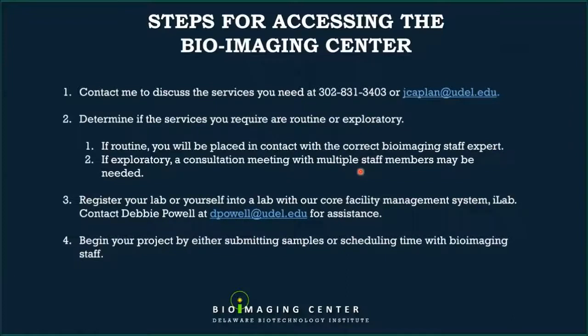So for routine services, I'll probably place you in contact with the correct bioimaging staff expert. For exploratory studies, or if you're not quite sure what you need, often we require a meeting. So it can be a consultation meeting with multiple staff members. If you really don't know what you want to do, then I'll invite you into one of our lab meetings. And so you'll give a presentation on your lab, the types of projects you have in your lab, and we'll discuss different ways that imaging can help your projects.